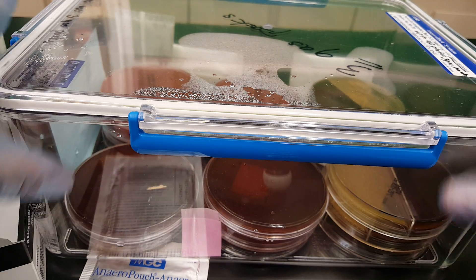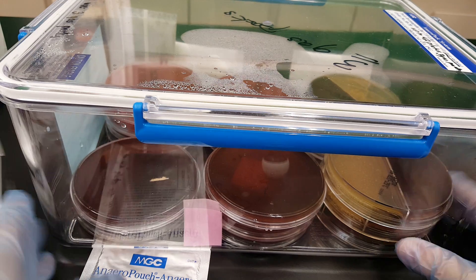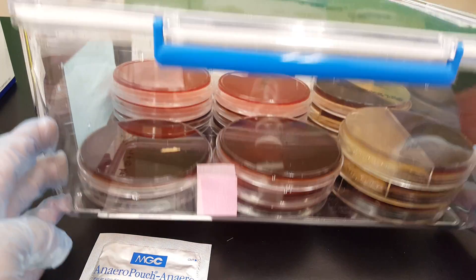Since these would be unused plates, I would put them right back in the refrigerator. If I had inoculated these plates, I would put them into the incubator.